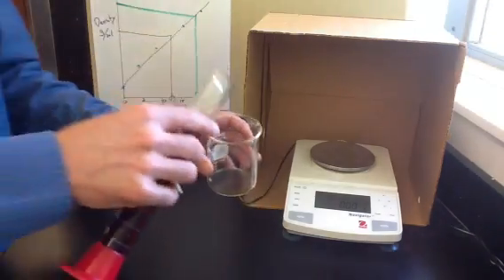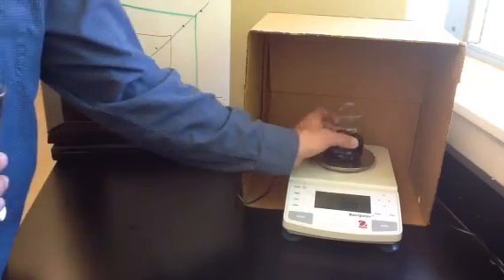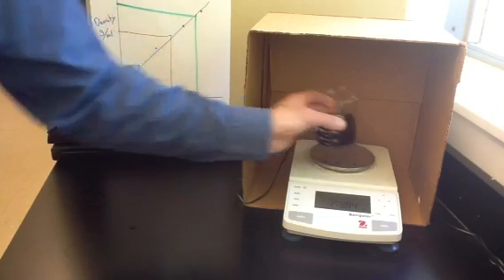This is the Coca-Cola. So 100 milliliters of Coca-Cola. We'll find its mass, 198.44. 198.44 for the Coke.